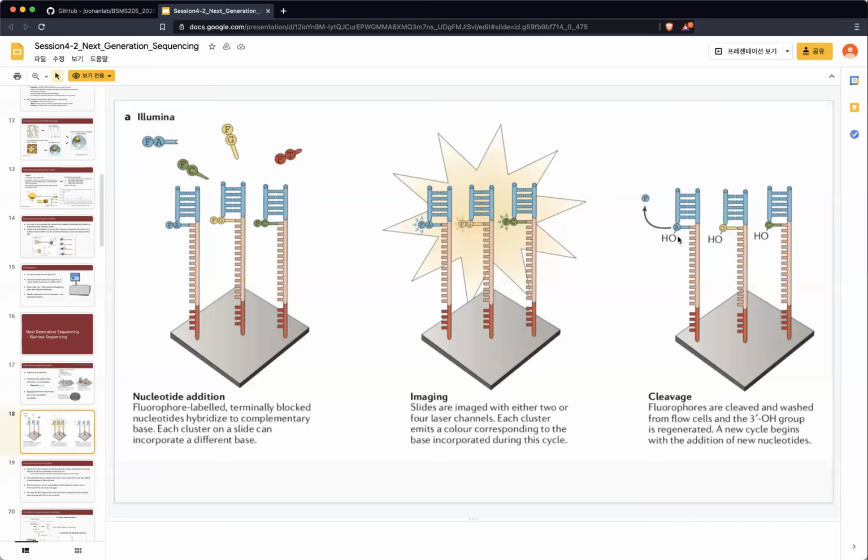So the basic idea is that you have multiple cycles to synthesize your sequence, and the number of cycles means how many times you can read out, for your length, right? So let's say you have 13 cycles, then you get a 13 base pair readout, right? If you have 100 cycles, then you have a 100 nucleotide readout. So each cycle you can read out a single nucleotide.